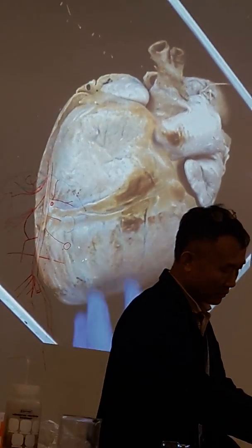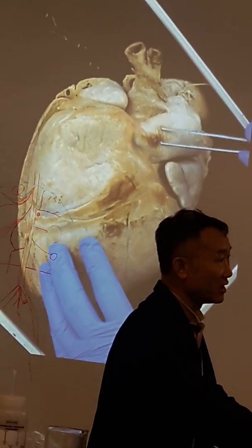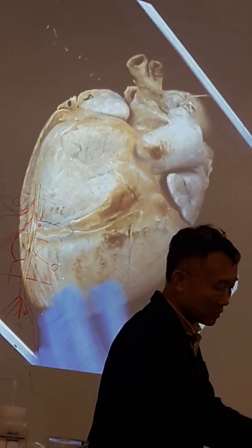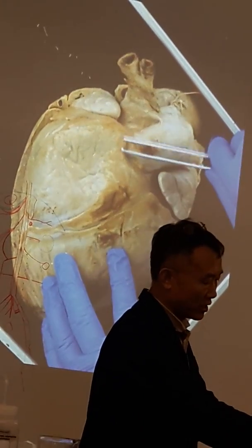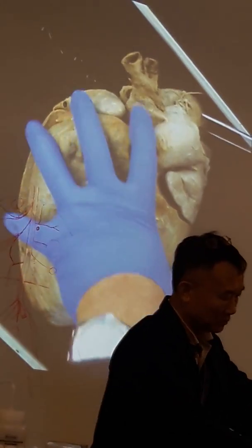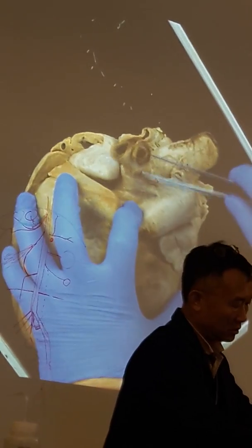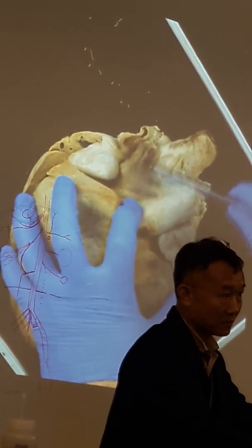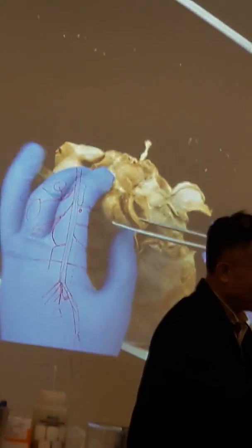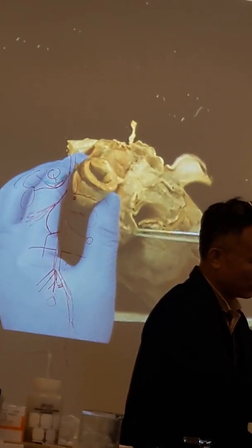Aorta. This one, located anteriorly, is the pulmonary trunk. So you first see the front view. You first see the pulmonary trunk because it's originated from the right ventricle, right? See that? This is aorta. This is aorta. Brachiocephalic. Okay. Aorta. You can see, if you look at it in this view, it's really thick, and the pulmonary trunk is really thin. See the difference?